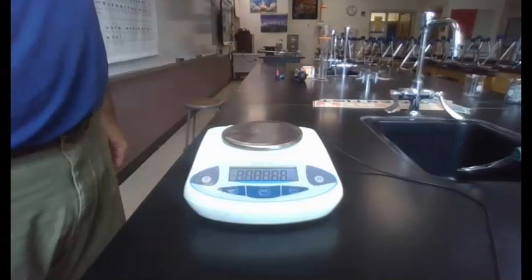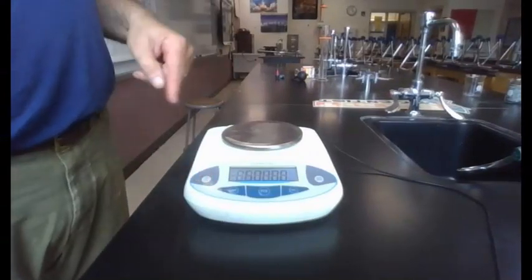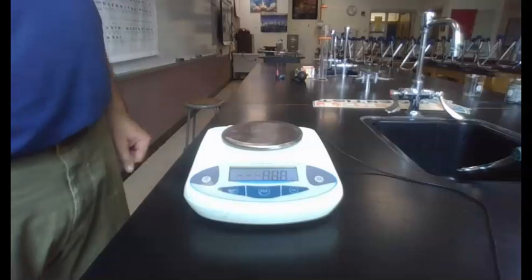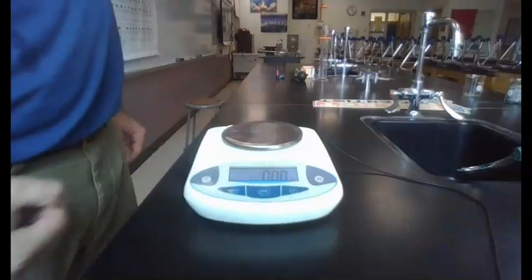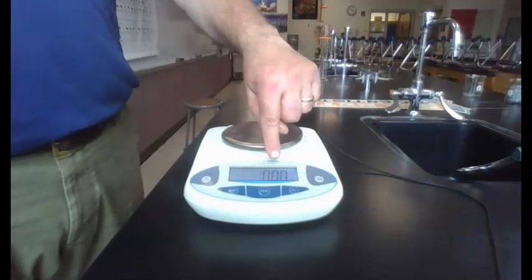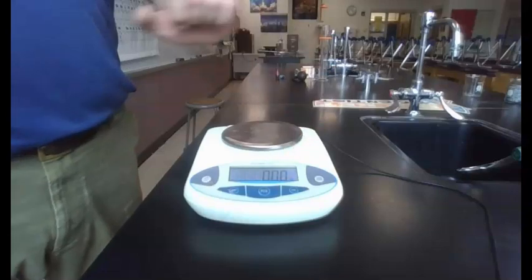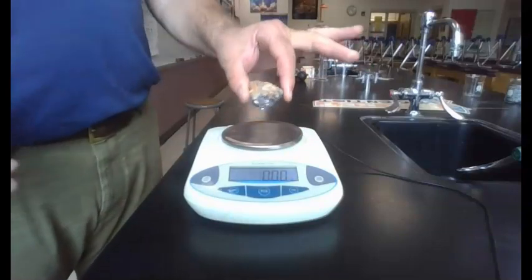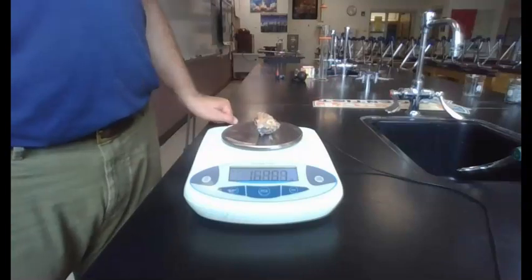And if I turn it on, you can see it will weigh up to 600 grams, and you have to give it a second to warm up. It's reading in grams, and you can see the decimal point is telling you that it can read down to the 100th of a gram. So if I put my rock on here, it's easy enough.